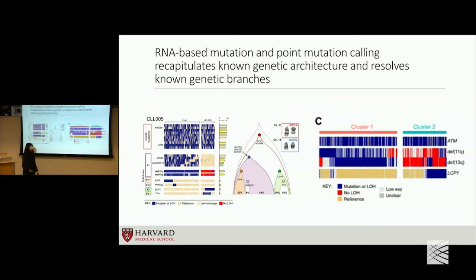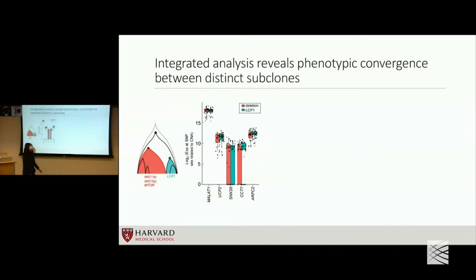And because we have the library split, we're now able to also assay for targeted transcriptional changes in the same exact single cells. For this, of course, you have to know a little bit beforehand which genes to pick. You're limited to, I guess, 96 or multiples of 96. So we decided to look at genes that we knew to be highly variable based on our single-cell RNA-seq analysis, just to see whether they were coordinatedly variable between the 2 genetic branches. Unfortunately, what we ended up seeing was that there really was not much of a difference between the 2 branches in terms of expression of these genes.